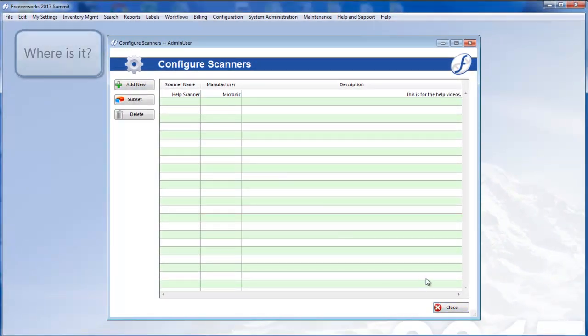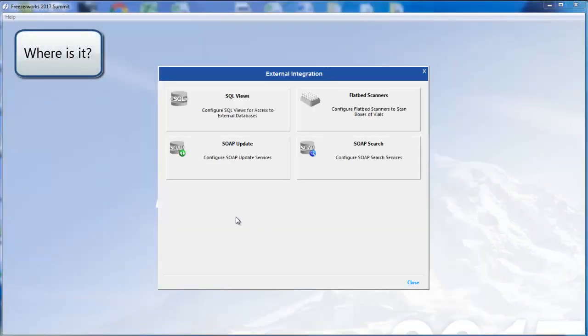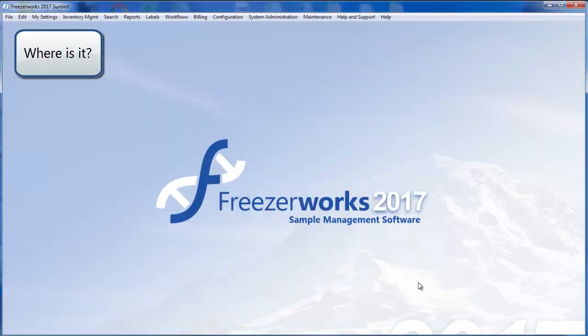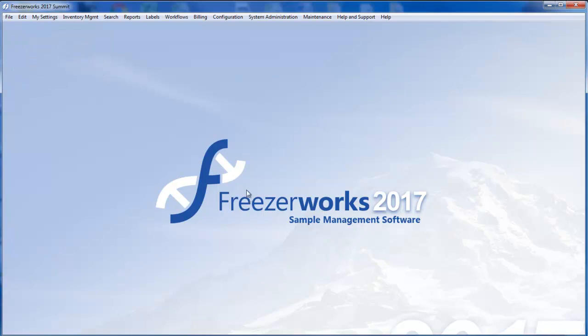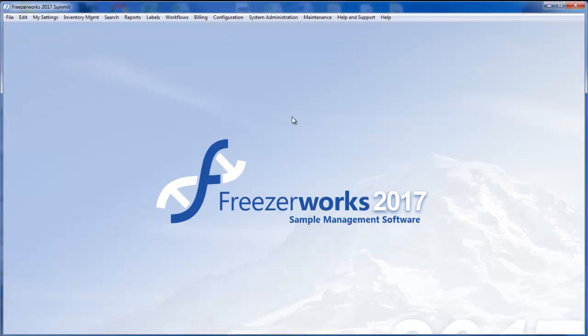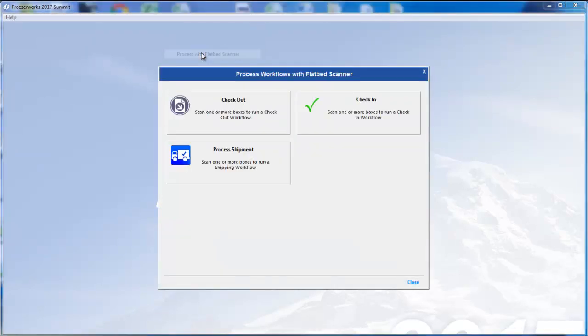So your scanner's configured. Now you can search, perform QC checks, and process workflows using it. You'll find flatbed scanner workflow tools under Workflows, Process with Flatbed Scanner. Each workflow type is available on this mini-menu.